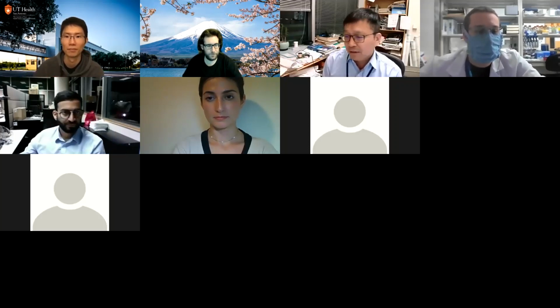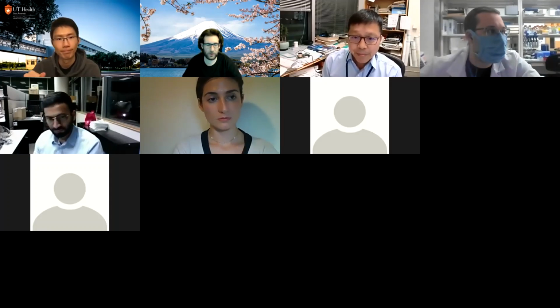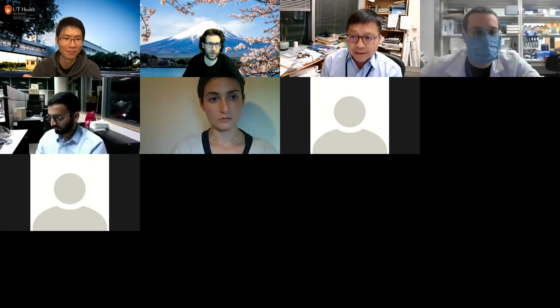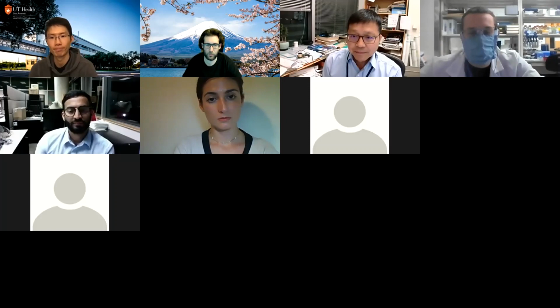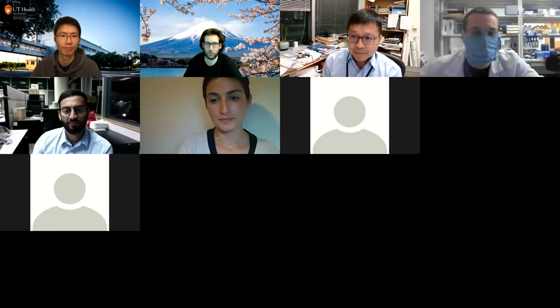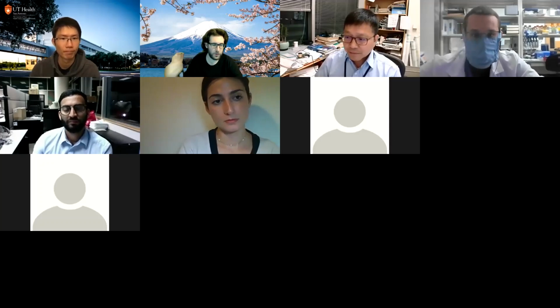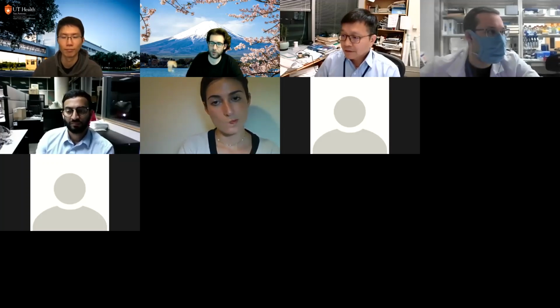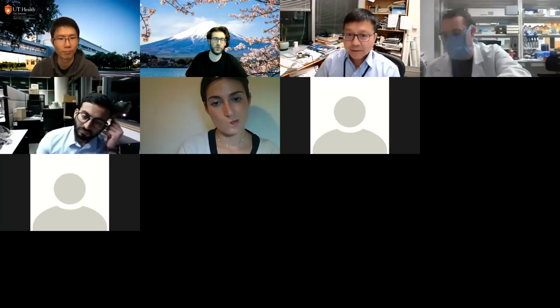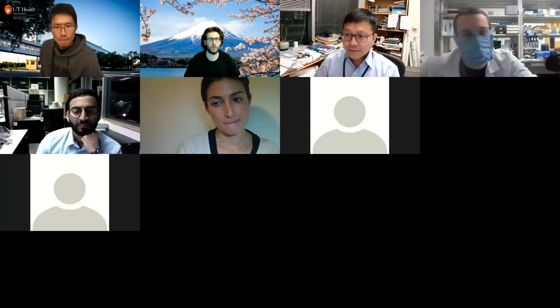You have it, it's understandable. So for the sake of time, because we're now quite a bit over time, maybe a couple of people had questions, but let's go ahead and just wrap up now, and then we'll hang out for a few minutes for people who wanted to ask any more questions. So now you've got an idea of how to use a Linux server to get the raw data and process it into the read counts that you can put into DESeq to do your analysis. So you've got the whole thing now. You can start from raw data and go all the way to the point where you've got your biological interpretation.